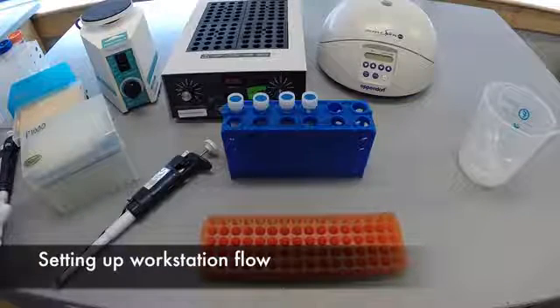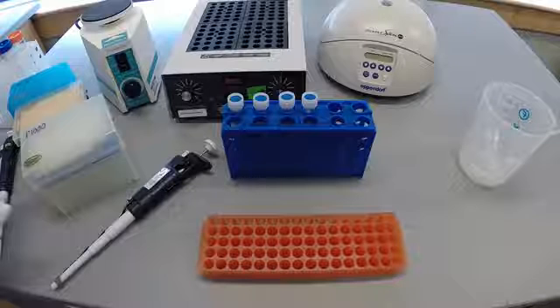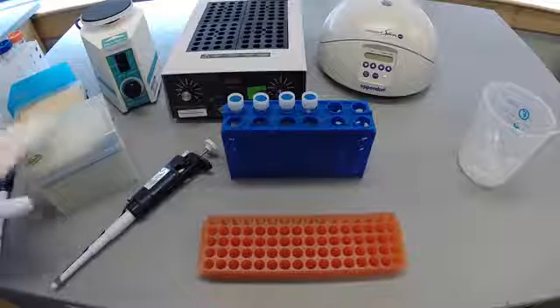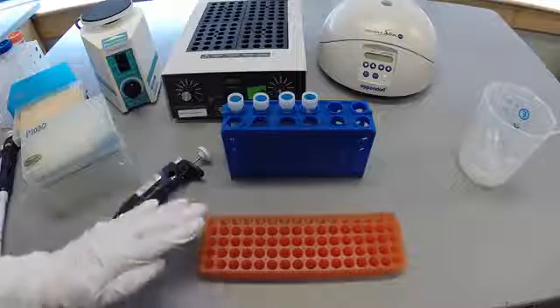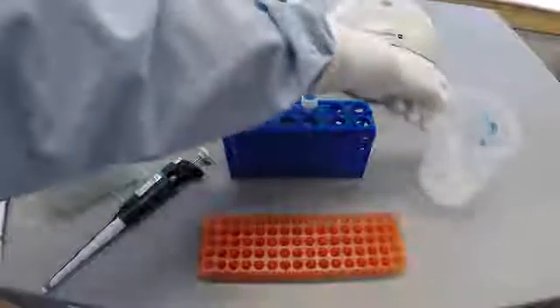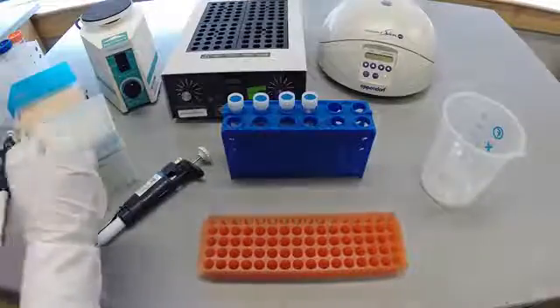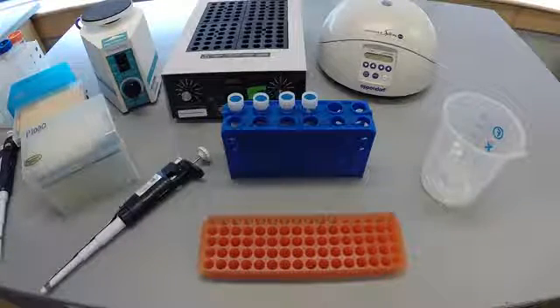Before beginning any protocol, you want to make sure that your workspace has a proper flow to avoid contamination of samples or reagents. This example is set up for a right-handed student. Tips and pipetters are on the left, racks and samples are in the middle, and the discard bucket is on the right. As your hand moves through the flow, it never unnecessarily crosses over the sample again.